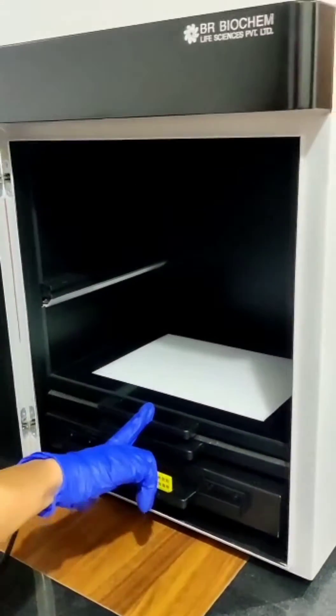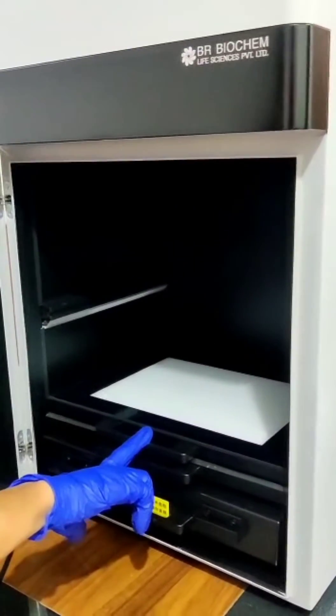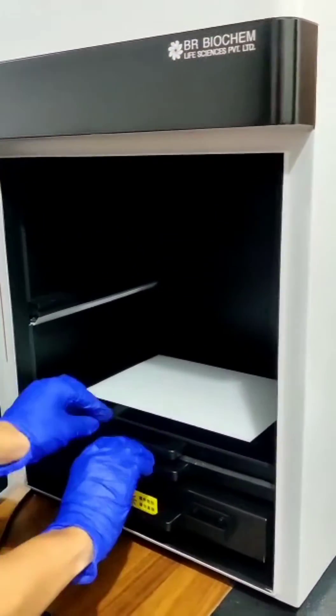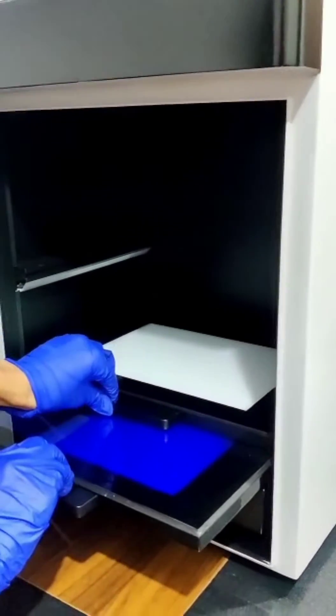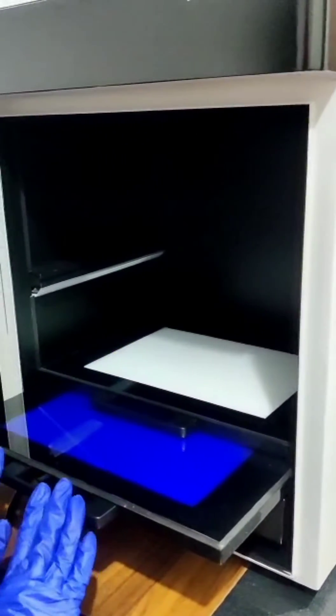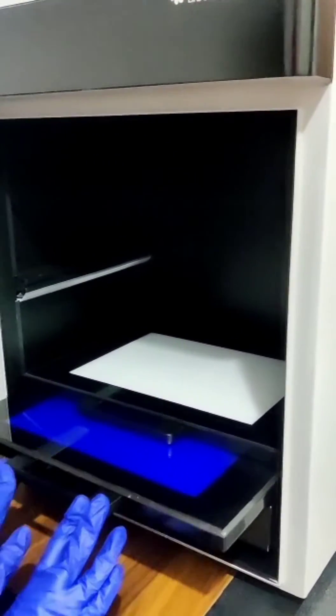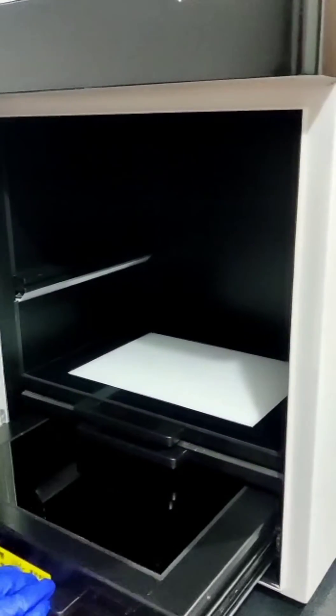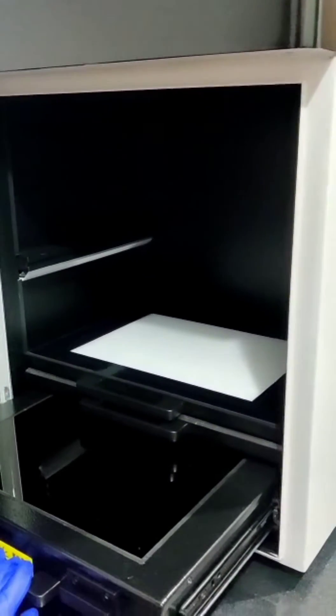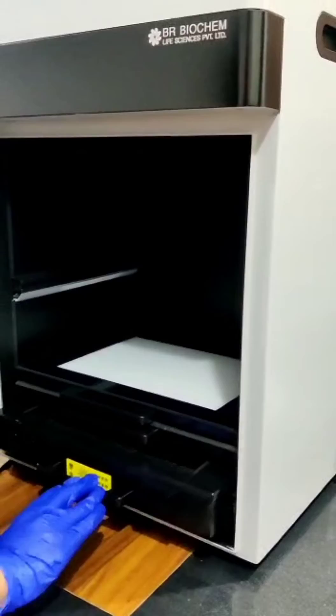This white light tray is used for protein analysis. This blue light LED tray is used for DNA and RNA analysis, and this UV Transluminator is also used for DNA and RNA analysis.